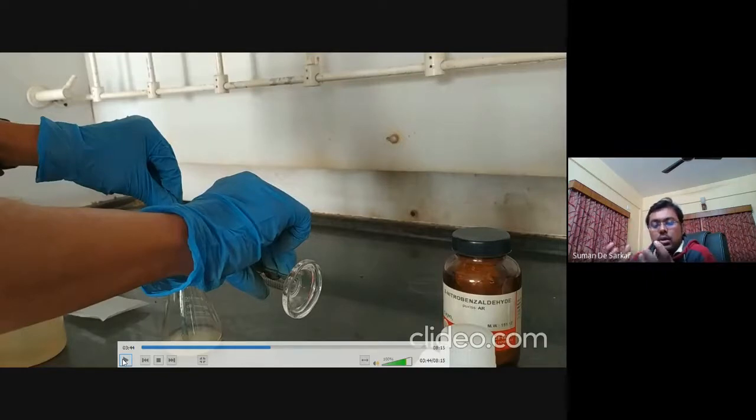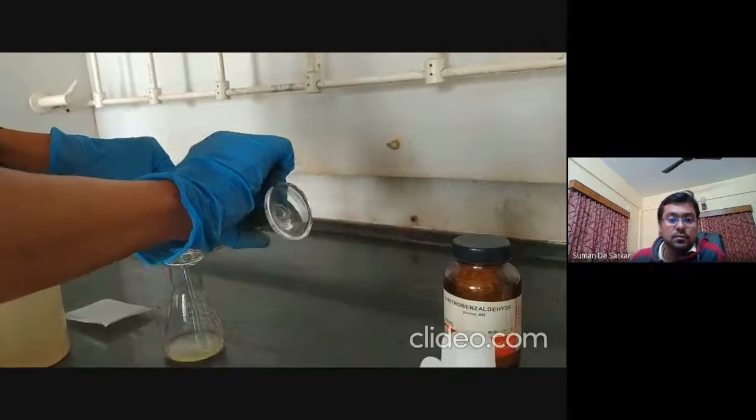We want the ortho-nitrobenzaldehyde to be in the solution in the dissolved state. That's why if you add slowly, the ratio of water and acetone will remain in ideal condition, and then you will not get the precipitate. But if you add fast, you may get some precipitate. That's why we are adding slowly and with stirring, just to keep the ratio ideal.